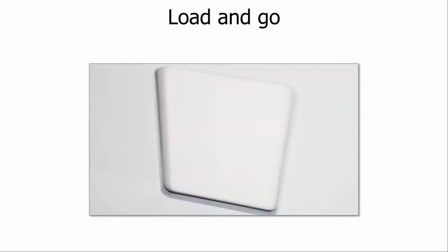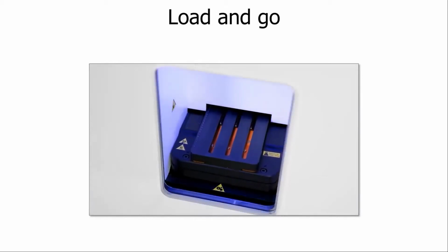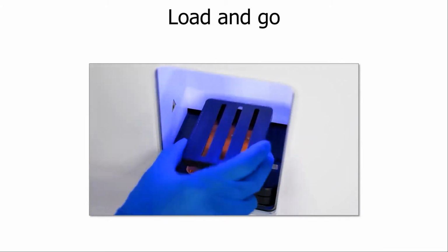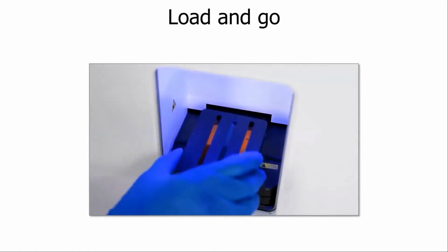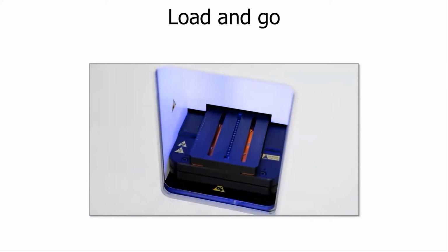Once you have a sealed Uni, the next steps from there are pretty simple. The Uncle's door opens up, you remove the sample cover, load the Uni and its blue frame onto the copper-colored Peltier heating element, put the cover back on, and then you're done. The Uni slides into the Uncle, and everything else is taken care of through the software.